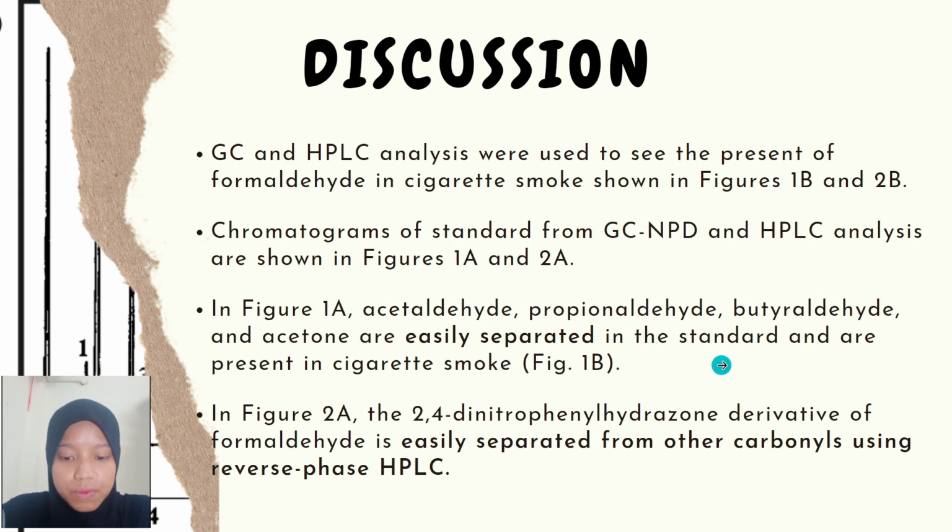As I mentioned before, in figure 1a, there are components that are easily separated in the standard GC and are present in cigarette smoke, as shown in figure 1b.